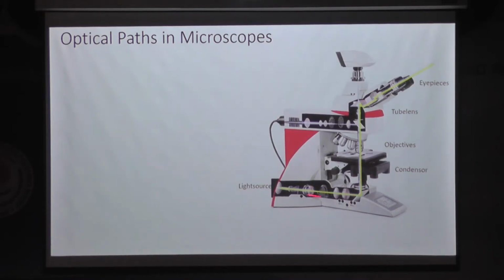But there are some more optics here, which help us have better visualization of the objects. It will not give more strain if all these components are involved. Gray light, green light, those kinds of filters are there, so there are more filters while the light is coming. Good light, bad light can be converted by these optics.